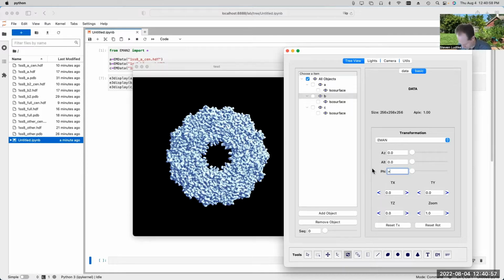So let me say I want to be able to do negative rotations here just for convenience. So I'm going to, well, that's fine. So I'm going to rotate that around, maybe there. That's pretty good. Okay, so that's minus 62.5. And then if I put an opposite azimuth in, 62.5, it's going to go back where it started.